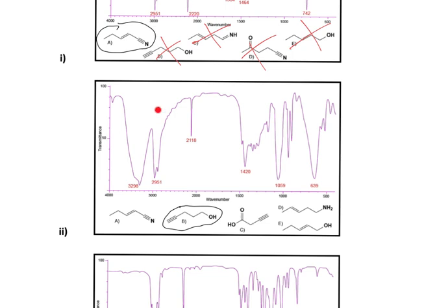Okay, so like this one, I see an OH. Look at that thing. That's a big, broad OH. So now, no OH. That's an NH2. NH2 looks a lot different, right? Also, this looks like a triple bond to me. So no, right? This has a triple bond and an OH, right? But do I see the C=O anywhere? Do I see anything here? Looks like nothing's there. So it's not this. So again, we're stuck here, and look here. You can even see the sp C-H is right there, the 3300. So you can see that terminal alkyne peak there too.